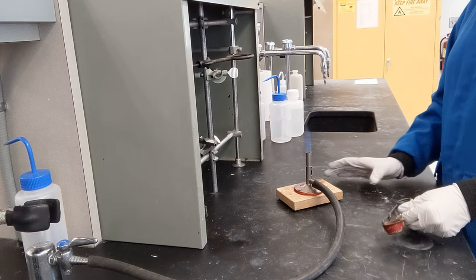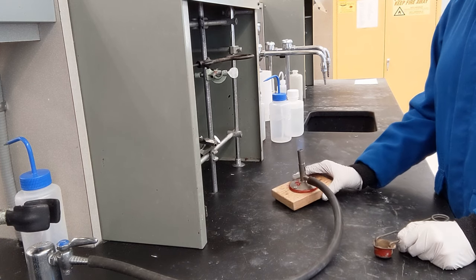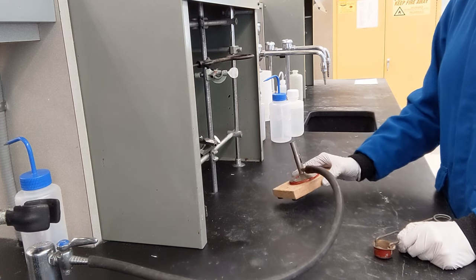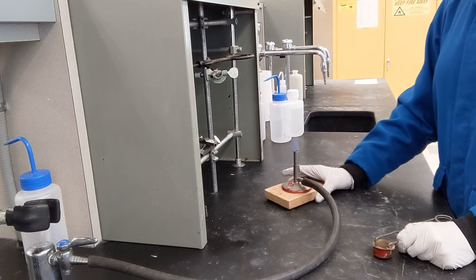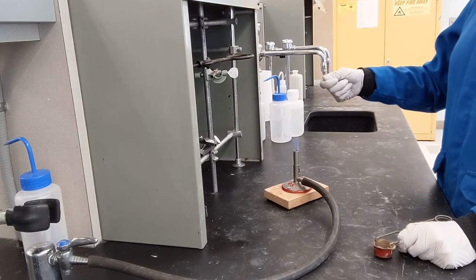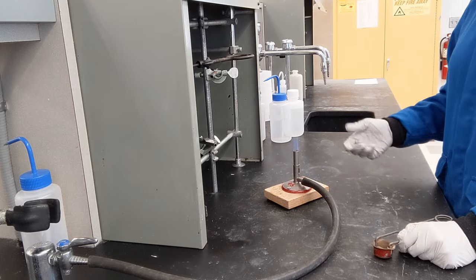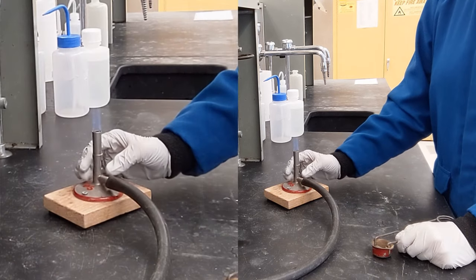So you can hold the base of the Bunsen burner and manipulate it around to heat something. Or if you want, you can hold tongs with something over the top. Make sure you keep the flame away from yourself.